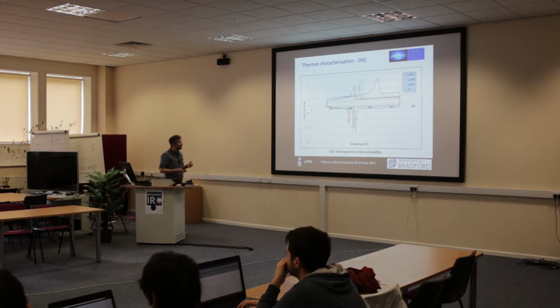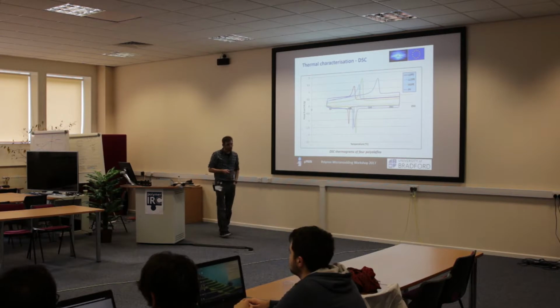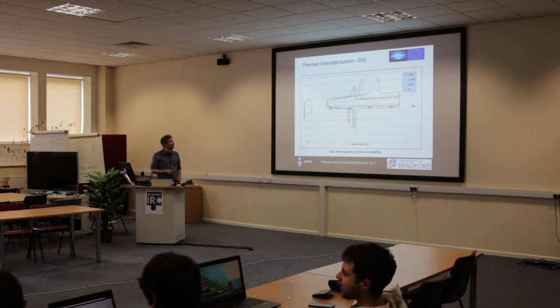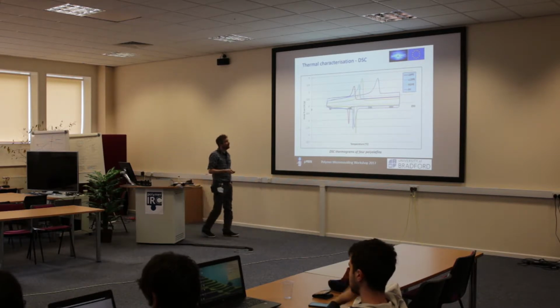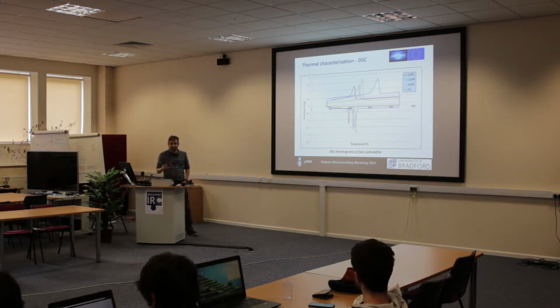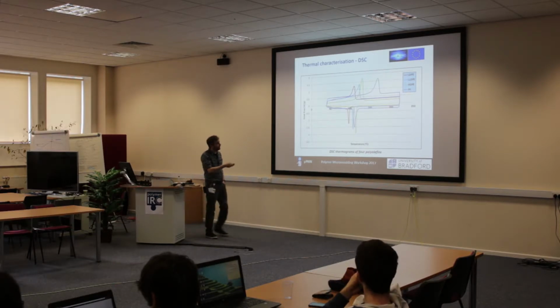You'll see more complex pictures. So here are some standard polyolefins, an HDPE, an LDPE, an LLDPE, and a PP. So low density, linear low, high density, polypropylene. Okay, so I'll just work out which way I'm going. These graphs can go either way. The negative is sometimes above and the positive is sometimes below. Chemists always do it the other way around. Engineers tend to do it this way.